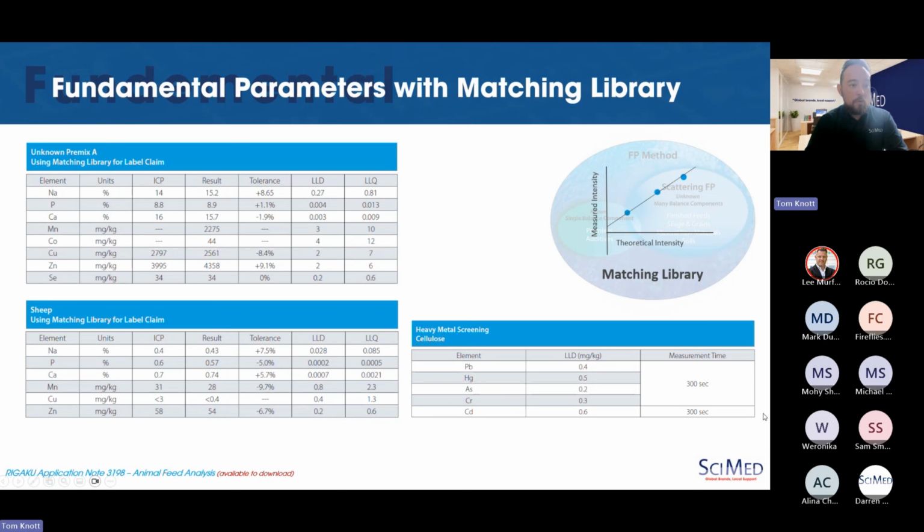And it's worth noting that even for heavy metal screening, you are getting very close. You can get lower limits of detection of sub ppm. So certainly for that screening approach that I highlighted earlier, for the presence or absence of heavy elements, you can get down to detection limits approaching those that you need to comply with. But of course, the lower limit of detection is not your reporting limit. Your limit of quantification should be at least 3 times that. Hence my earlier slide highlighting around 1 to a couple of single digit ppm would be where I would be confident reporting from XRF.